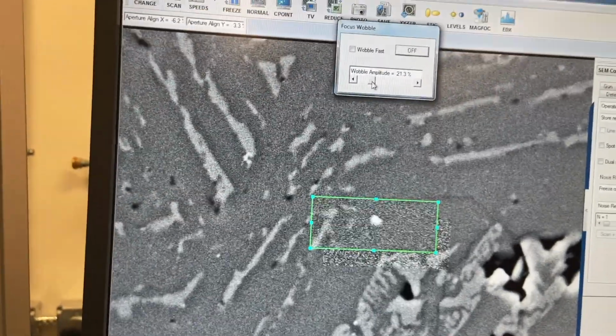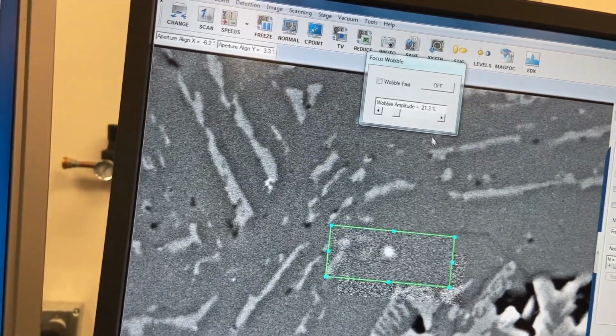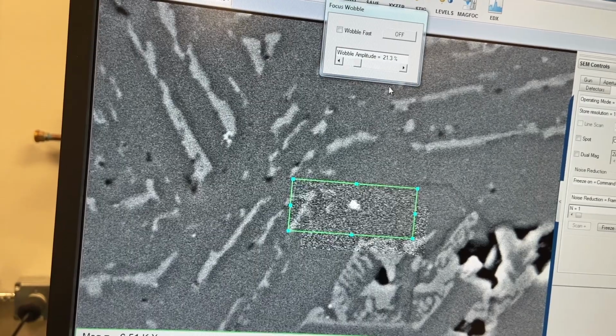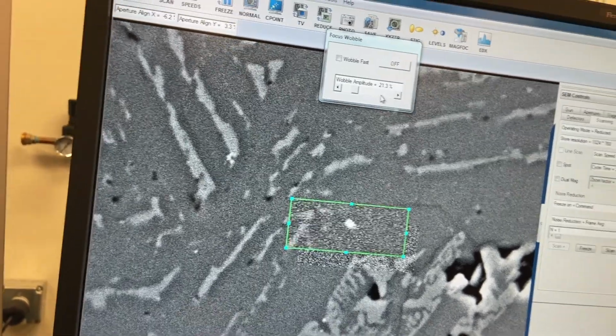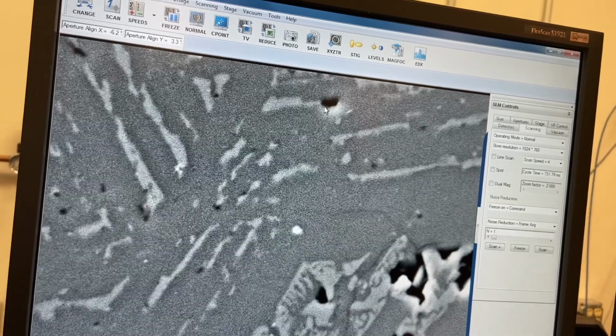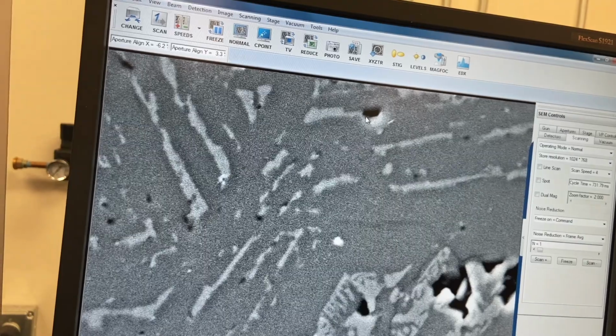All right, let me put that on. That's minus 6.2. That's okay, I guess. All right, so I'm gonna stick with this for now. If it gets bad on the imaging, I can always change it, but I don't think it's too big of an issue since I'm not going too far down. So let me keep it at that.